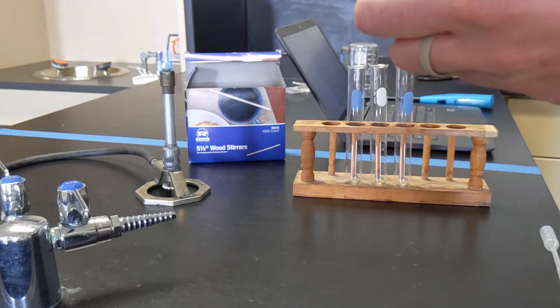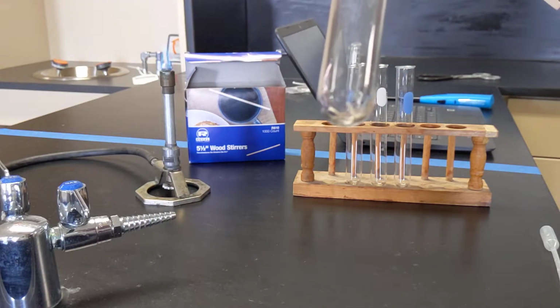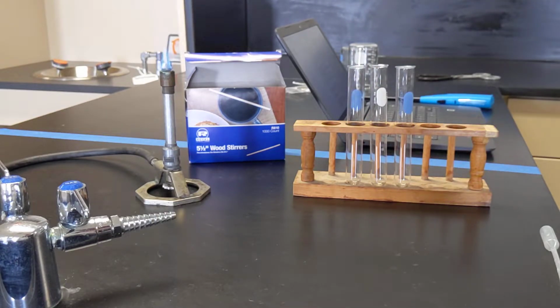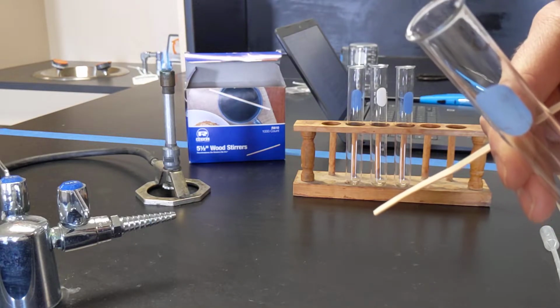There's three gases that we're testing for: hydrogen gas, oxygen gas, and carbon dioxide. Hydrogen gas is very flammable, so when the red hot coffee stirrer goes into the test tube, it should ignite the hydrogen gas, which would make a popping noise because of the shape of the test tube, the opening there.